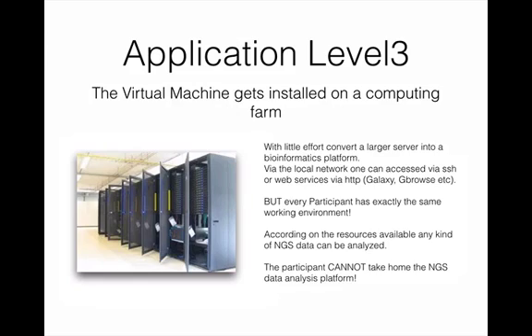Then we have the level 3 application. Level 3 application is where we install the virtual machine on a computing farm. Again, with a little effort, we can create an entire bioinformatics platform.